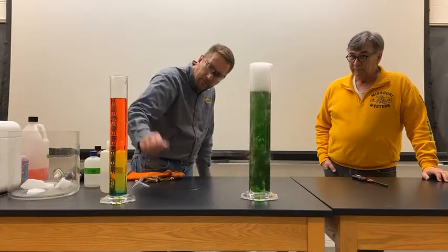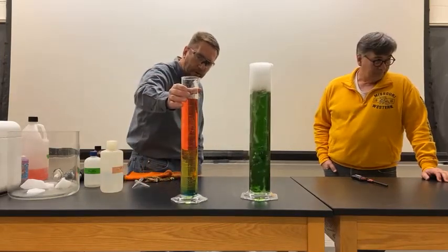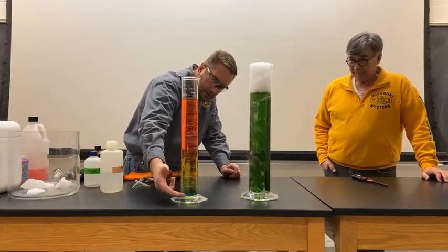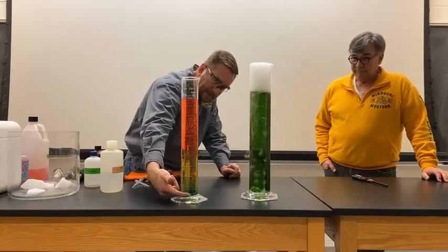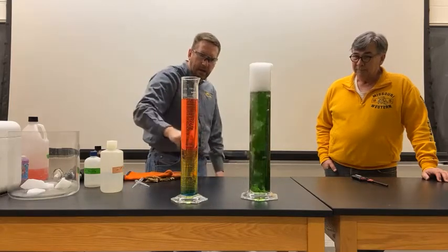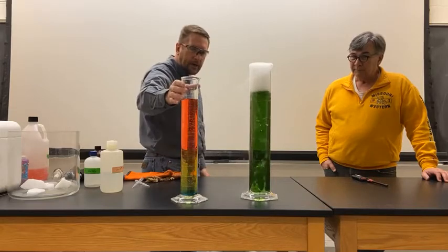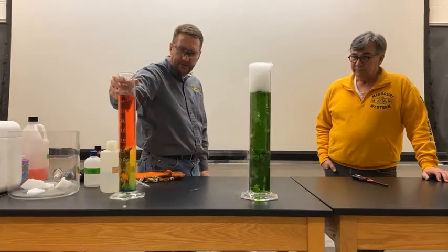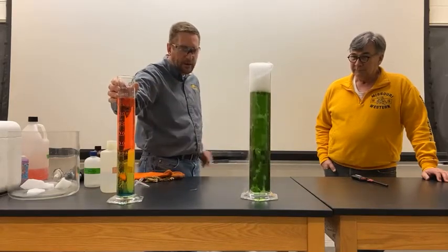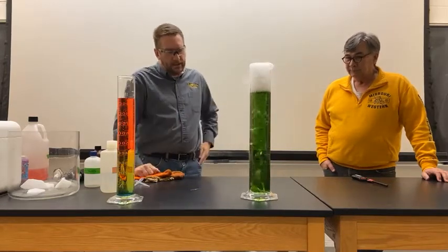So again, if we go back to what we made earlier, sort of our rainbow effect here, this was a basic, and then we became more acidic as we moved towards that red color. And so the yellow is right next to the red. So the yellow color is really pH between 5 and 6 for a universal indicator.